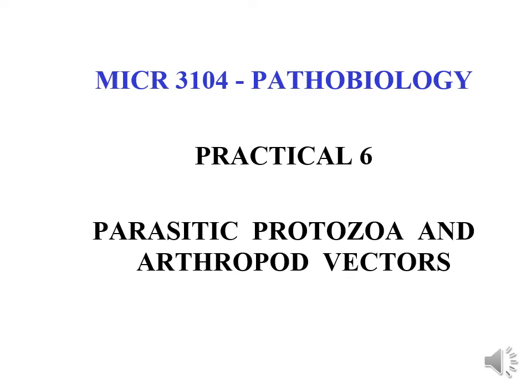So even in your exam, the exam is going to be very simple. We'll give you a photograph of a parasite, for example, or an insect vector, and we'll ask you to identify it. And then there may be a question or two relevant to that slide. So please just feel more relaxed and study, and make sure that if the picture is shown to you again, you will know whether it is a cyst or a trophozoite or a whole parasite or a larva, etc.